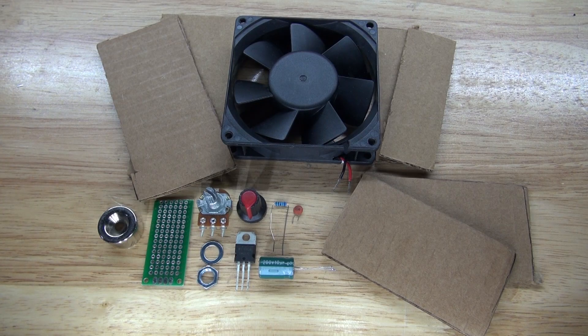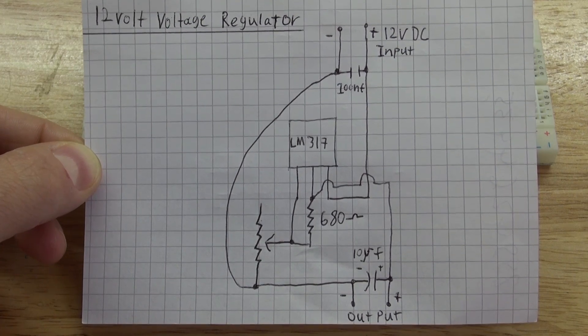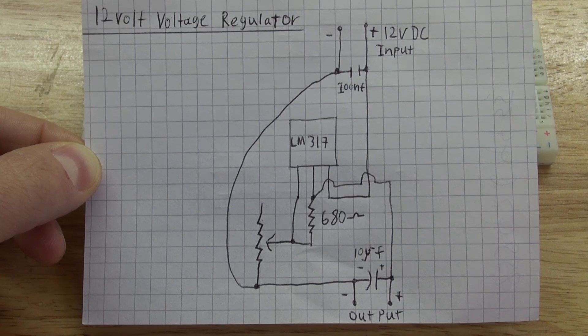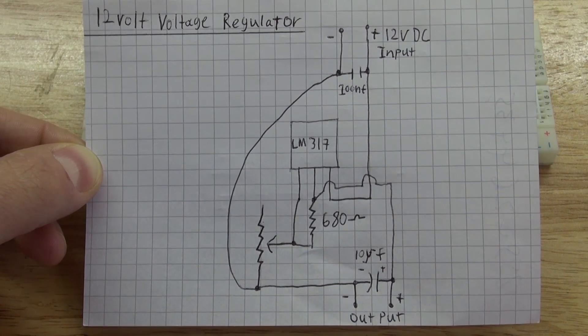These are the items you're going to need to make for this project. This right here is the schematic that you're going to need to follow to make the circuit. If you want, you can pause this video to make the circuit yourself, or watch the video to see step by step how I made it.